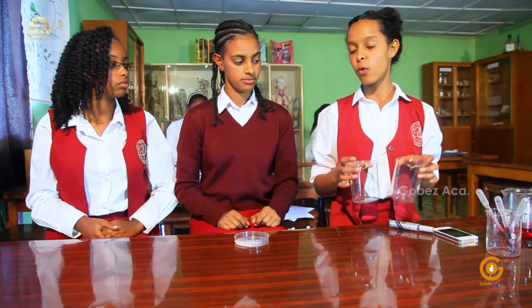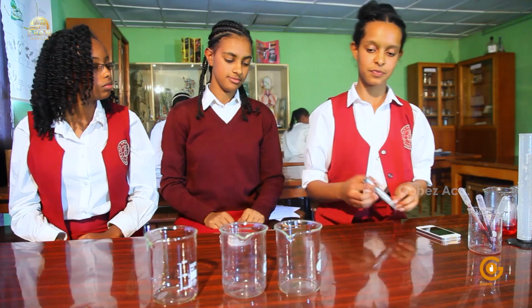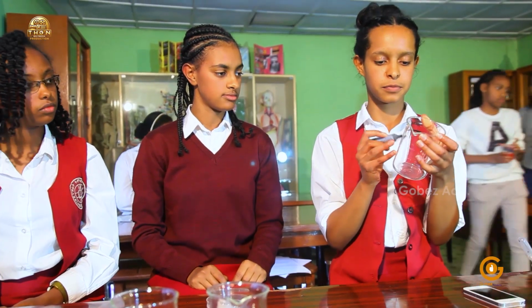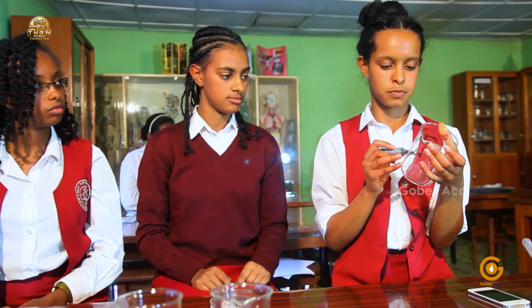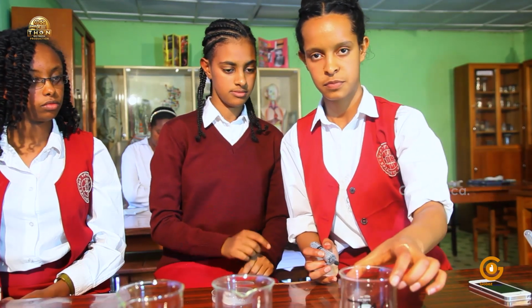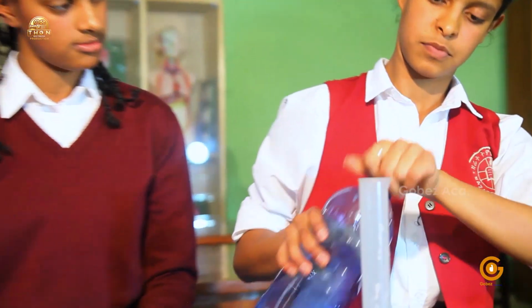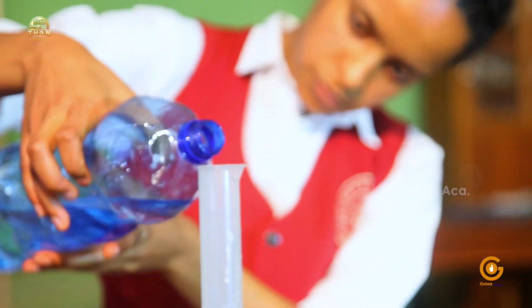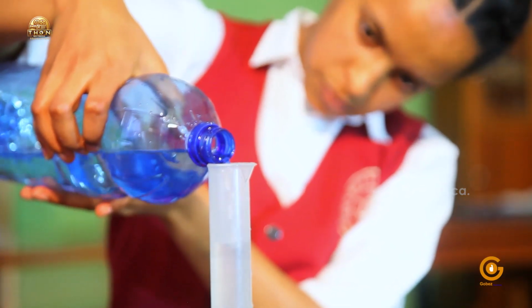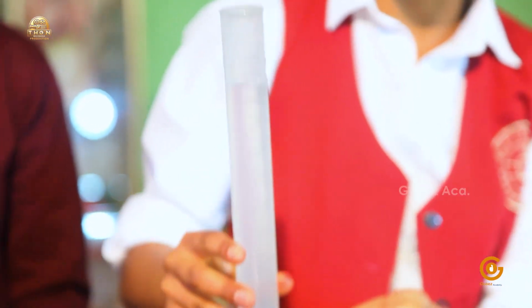For these experiments, we require new beakers. Just as I did before, on the first beaker, I write tap water on it. And I pour into it water from the tap.